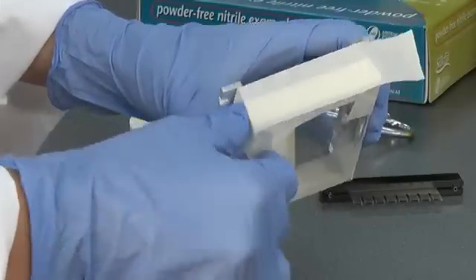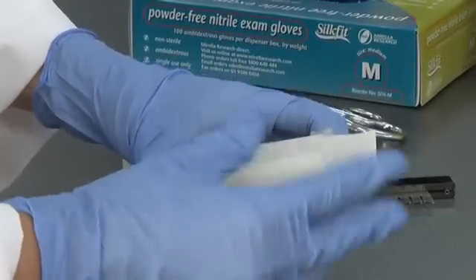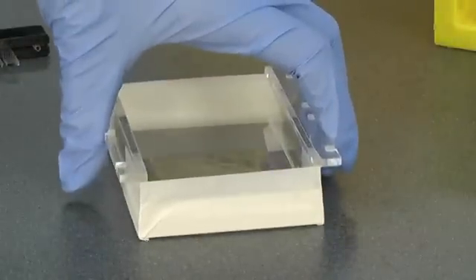While the agarose is cooling, you can prepare the casting tray. Apply tape to each end of the casting tray, pressing the tape down firmly on all sides. Place the casting tray on a level surface.